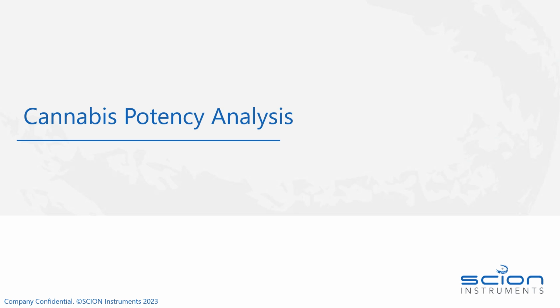Today I will be discussing cannabis potency analysis. What do we mean by cannabis potency? What compounds do we test? Why should we test? And some of the analytical techniques that can be employed for identification and accurate quantification of these compounds.